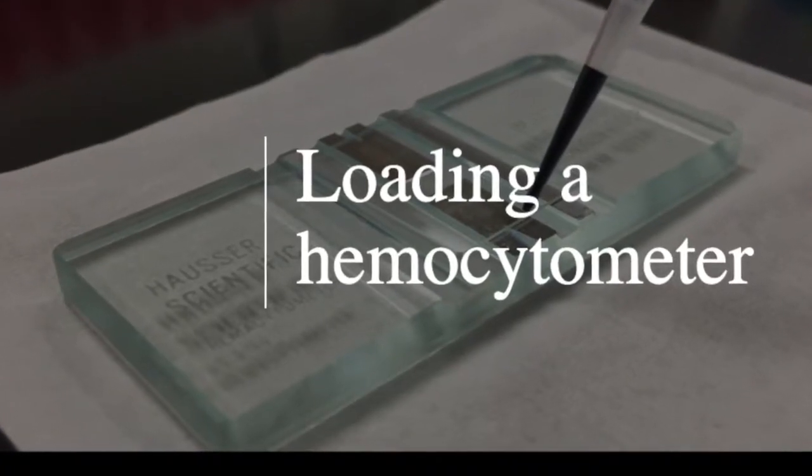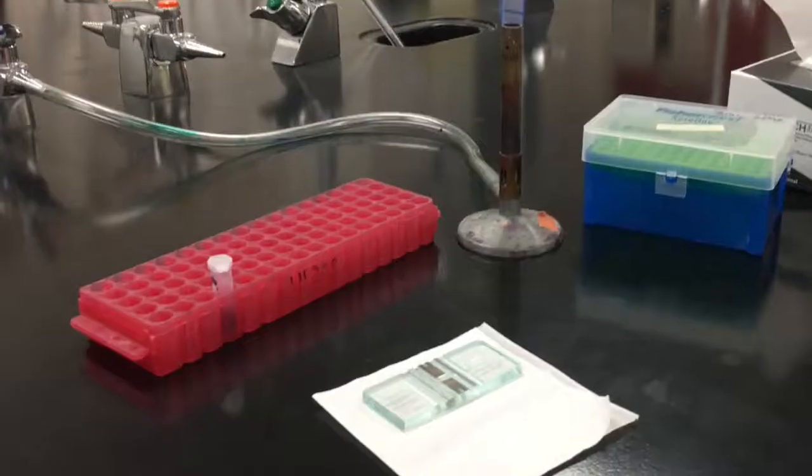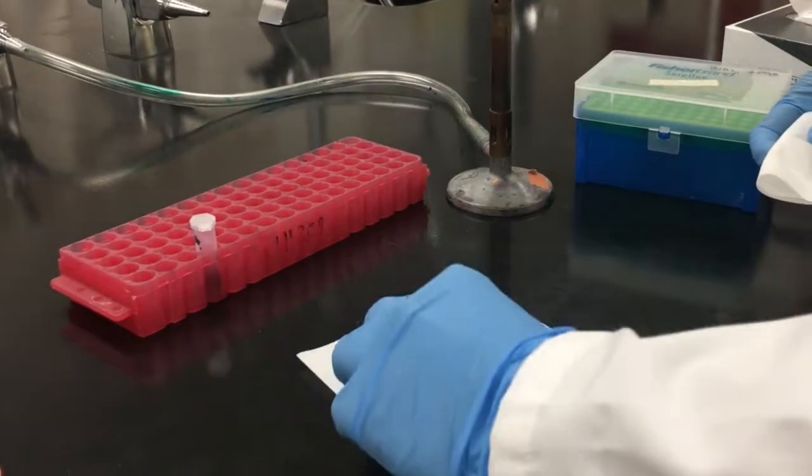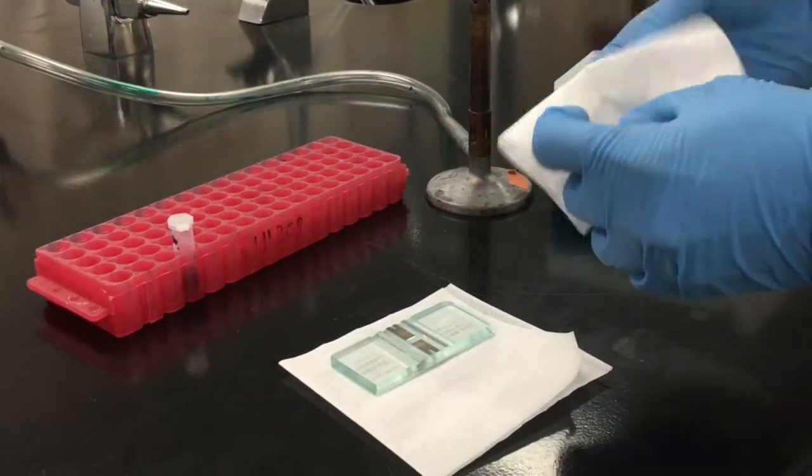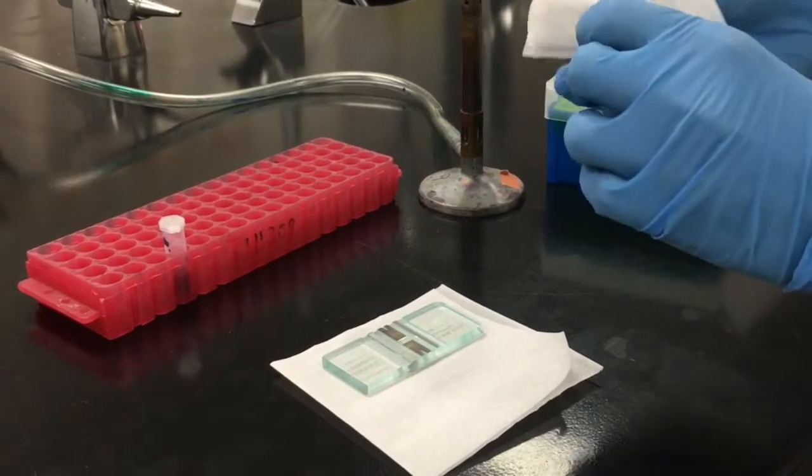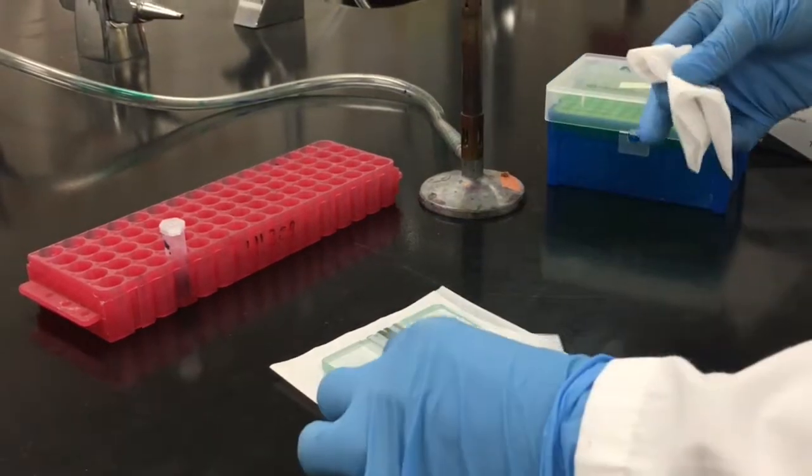This video will show you how to load your hemocytometer. To begin, start by cleaning the counting chamber and the cover slip with 70% ethanol. Be sure you're using lens paper or a kimwipe to avoid scratching the surface of the counting chamber or the cover slip.